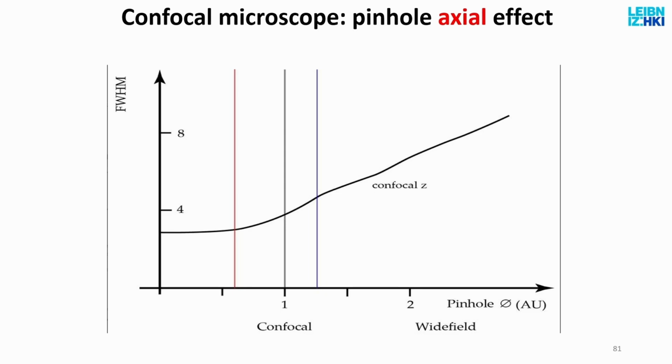And it's even worse with, like I said, STORM and so on. But you really need a wide field image at least to know it. And so usually it's combined. Leica, for example, has this special format, LIF format, where you combine the confocal at various wavelengths and the STED at various wavelengths in one file. And then you put this into JIPipe in this case, and then you separate the channels. Okay.